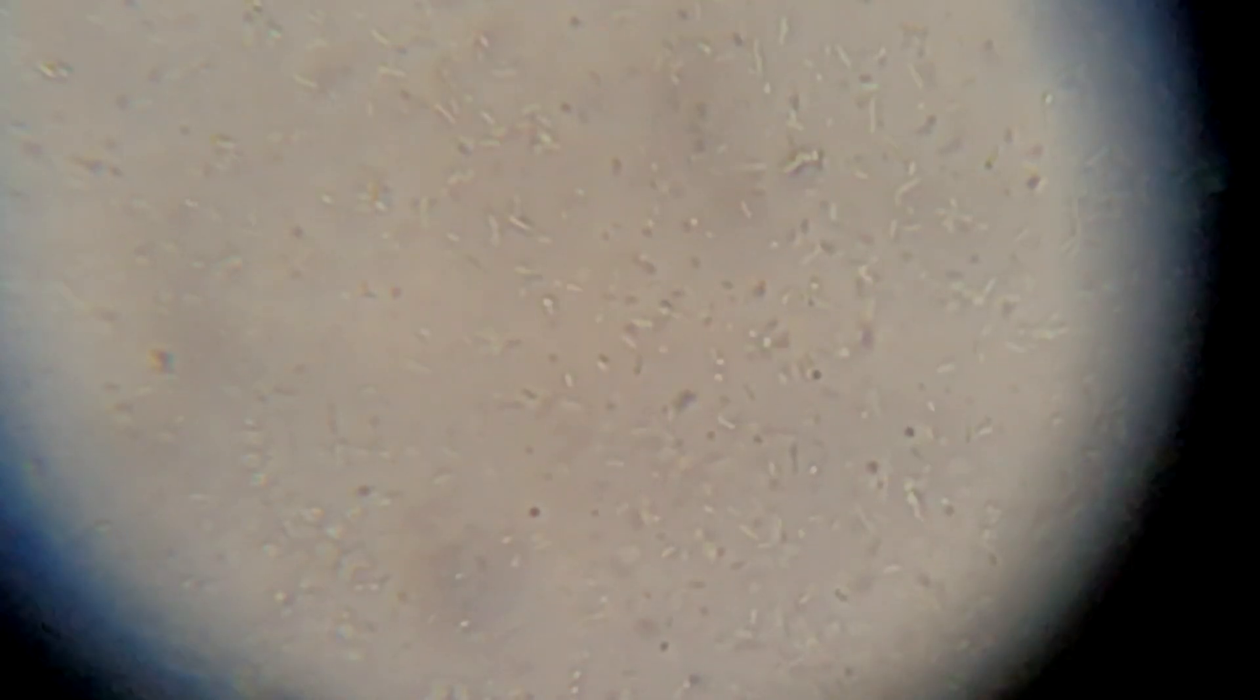You can see this one is going much faster. See how it is beautifully moving through the sample. And you can see these which are completely stable, not moving at all.